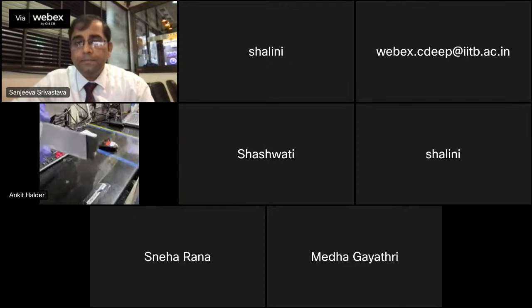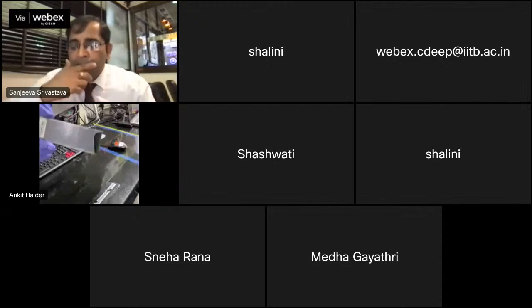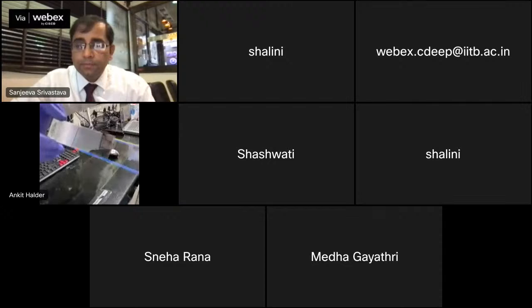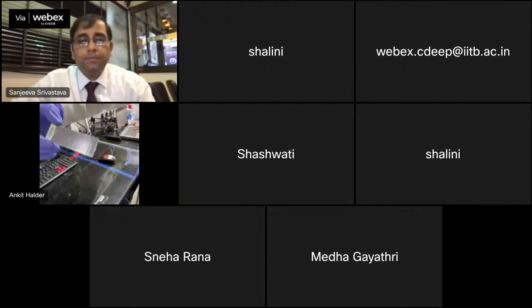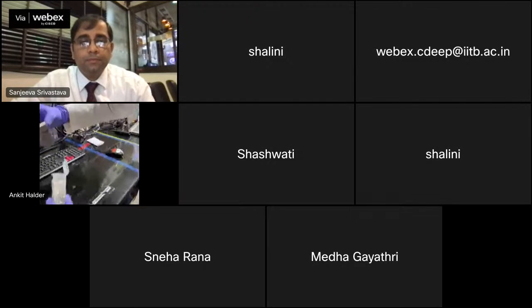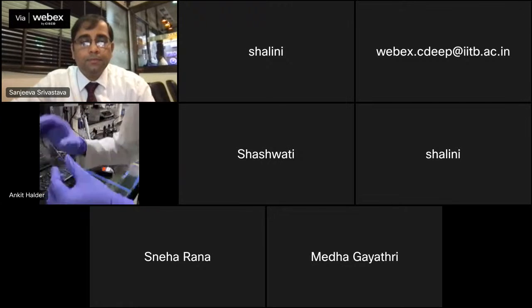This is a microarray chip, you can see. Here thousands of proteins are printed on the chip, almost 40,000 proteins, in duplicates. This is a kind of HuProt array, manufactured by CDI Laboratories. So this is a protein microarray. This is one work we are doing. Another chip I want to show is called a peptide array.